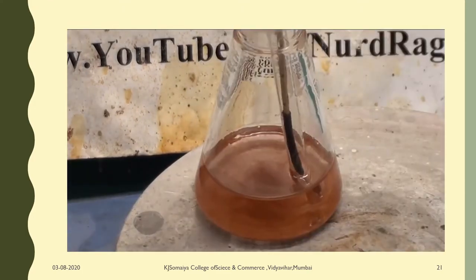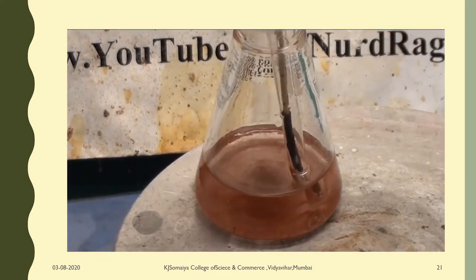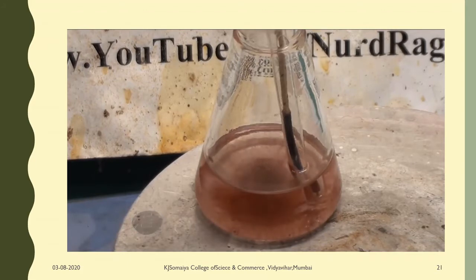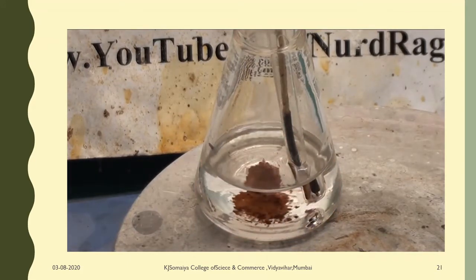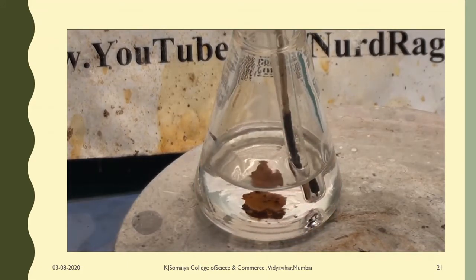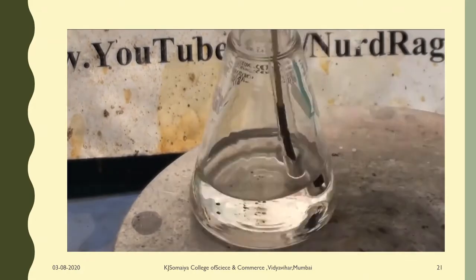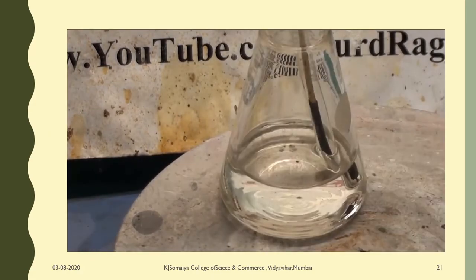Now heat the mixture until the cadmium oxide completely dissolves. What's happening is the cadmium oxide is reacting with the oleic acid to form cadmium oleate. After the cadmium oxide dissolves, keep heating until the mixture hits 225 celsius.